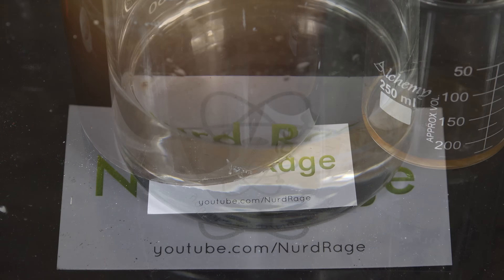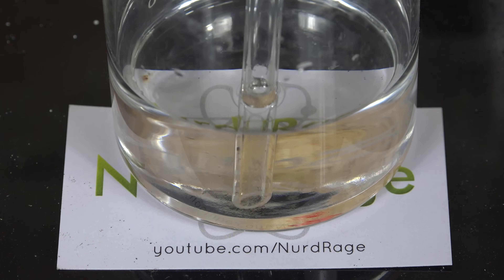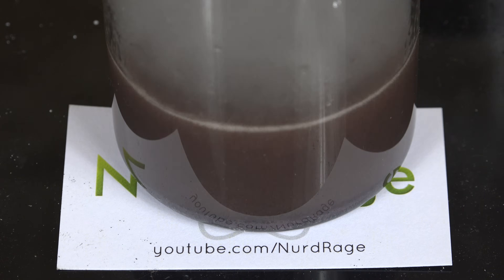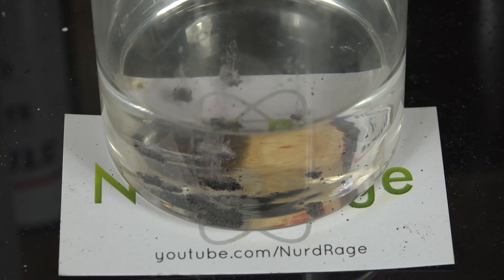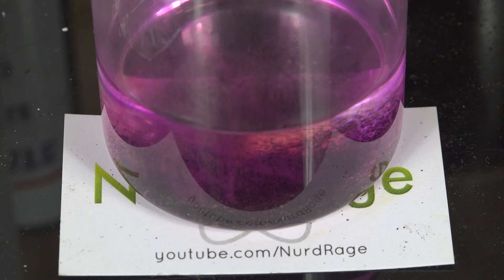Let's try that again. Be very careful when sprinkling in the potassium permanganate, because if you accidentally dump it in it will break the layers and cause them to self-stir. At that point the mixture can no longer make the thunderstorm. So start with small amounts and go slowly until you get some practice. But eventually with a steady hand we can add a fair amount of potassium permanganate and really get it going.